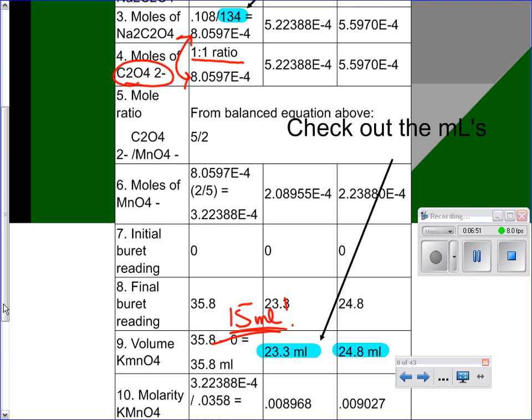There is a crazy thing that goes on with this titration, and I've talked to a bunch of professors about it, and the big thing is this particular activation energy. When you start, we don't know if the activation energy is low or whatever, you're going to add a couple drops at the beginning, and it's going to stay dark purple, and you haven't even added like 3 or 4 drops, you're going to freak out. Just let it sit. It'll clear up, and then you can continue your titration normally. So just be aware at the beginning, it's going to be crazy weird, but it'll get better.